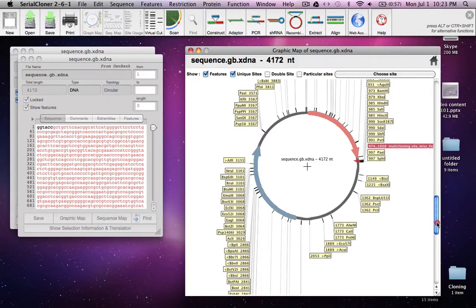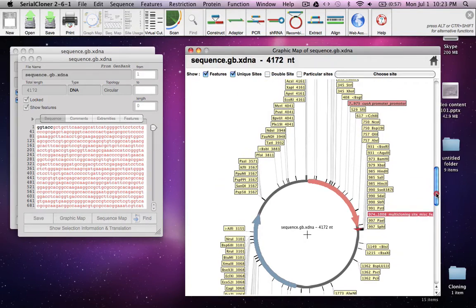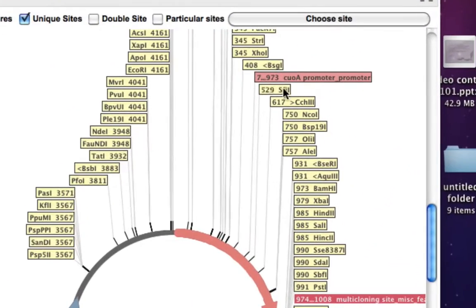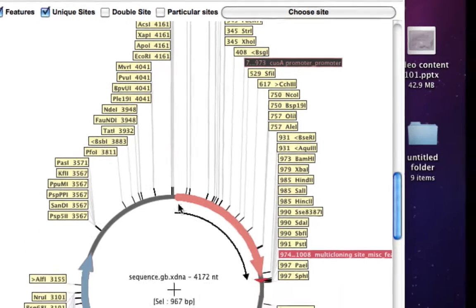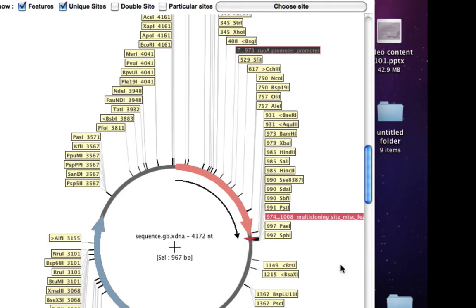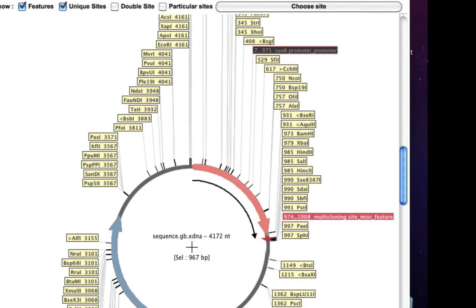You can see that it has a QOA promoter from 7 to 973 base pair, here it is. At the end of it you have a small multiple cloning site.